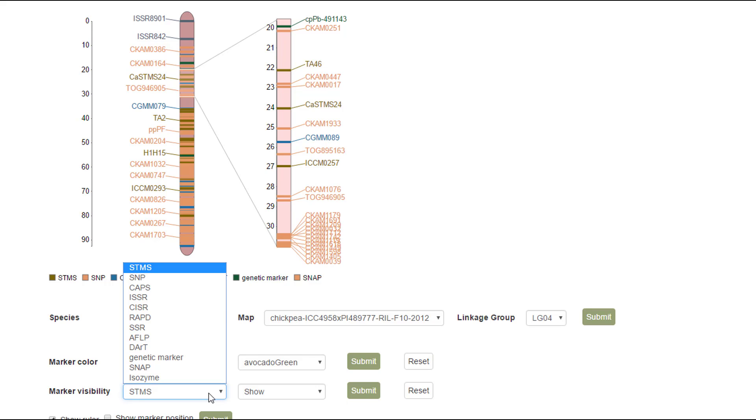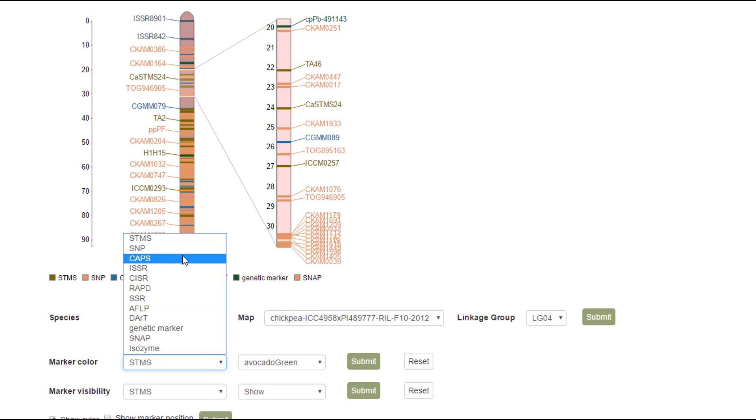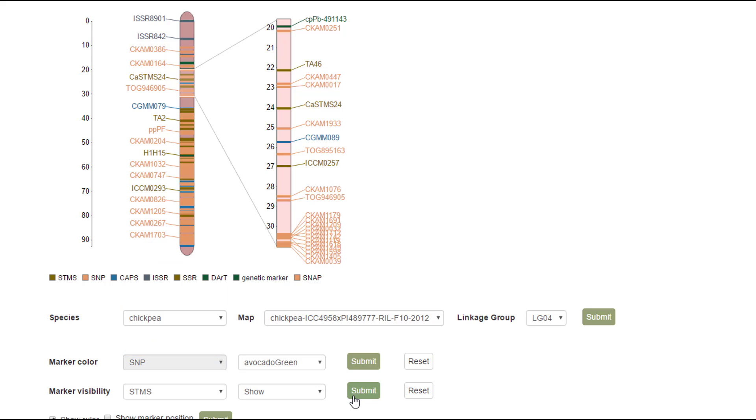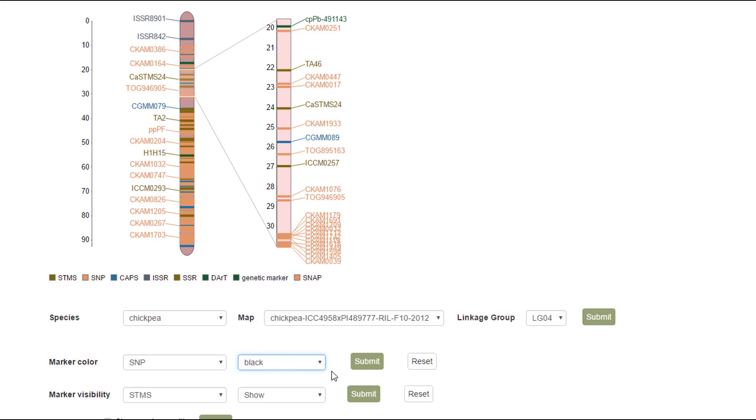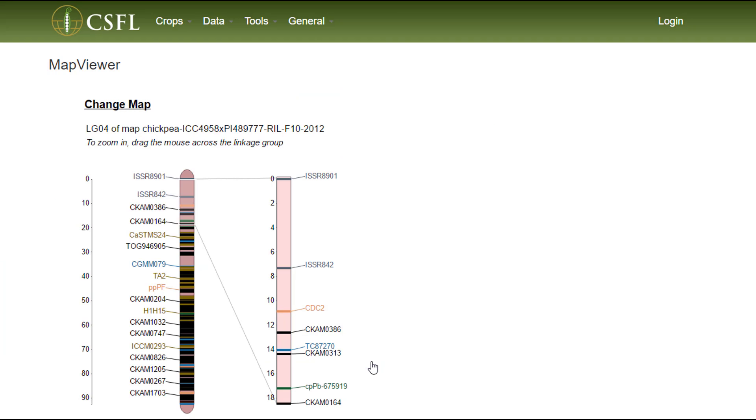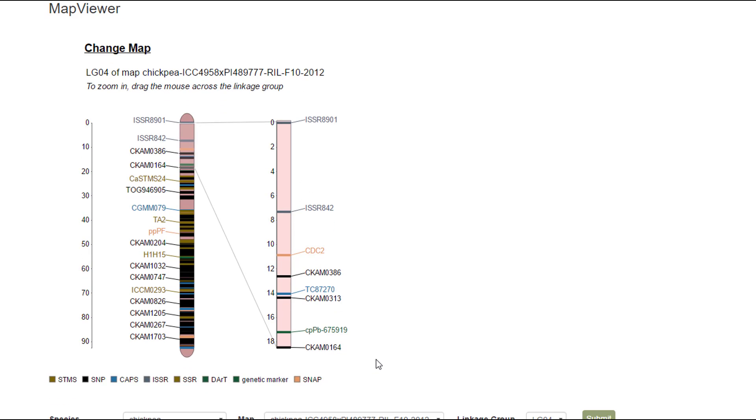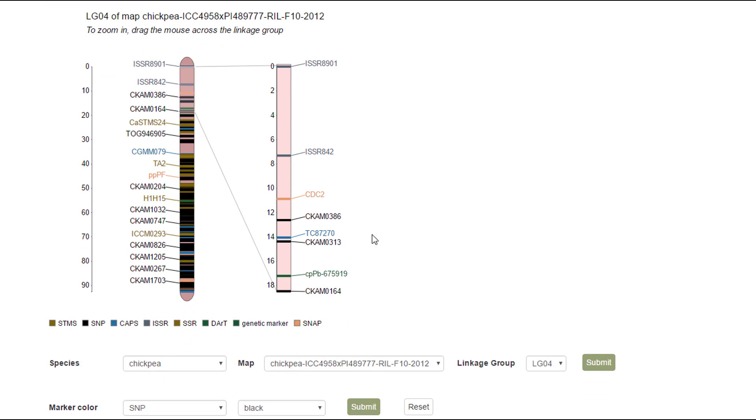So let's say we want to change the color of the SNP markers. We just select SNP and then pick a different color. It's very important to hit the submit button in order to see the changes. You can see now that the SNP markers are black.